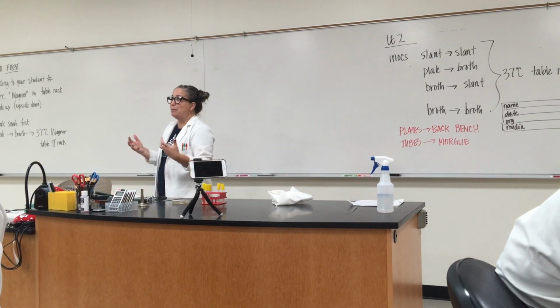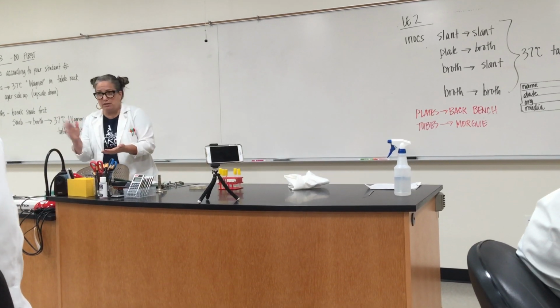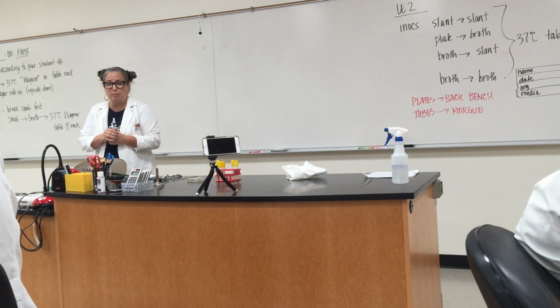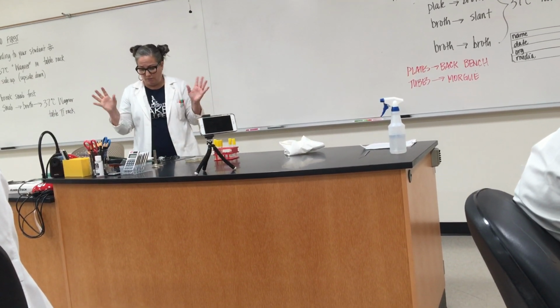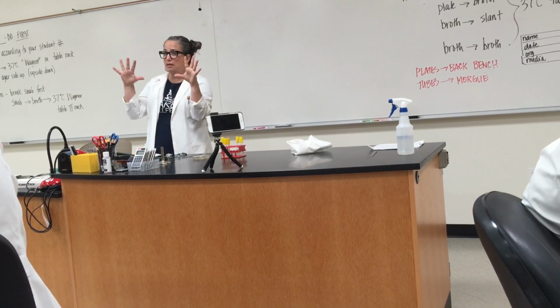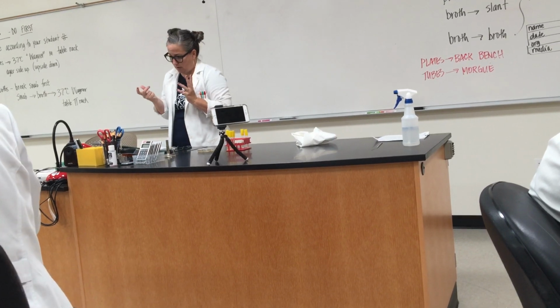Bathroom sample. That means you get to go to the bathroom and you can either brush the counter off onto it, or you can take a cotton swab and swab some area of the bathroom and then rub the cotton swab on the surface of the agar, right? Whatever you want to do. Fingertips touching the media. So you take your dirty, filthy hand that you think is clean and you touch the surface of the agar with it. See if anything grows. Right?